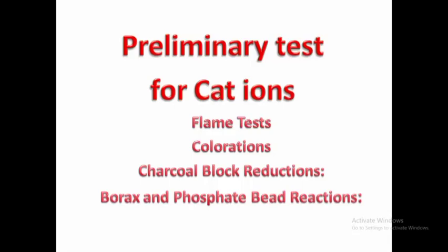Hello everyone. We're going to talk about the preliminary test for cations: the flame tests, the charcoal block reduction and charcoal cavity test, the borax bead reaction or borax test, or the phosphate bead test. We're also going to talk about the ammonia test.